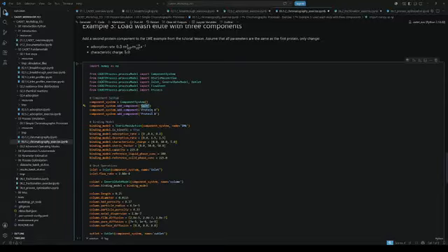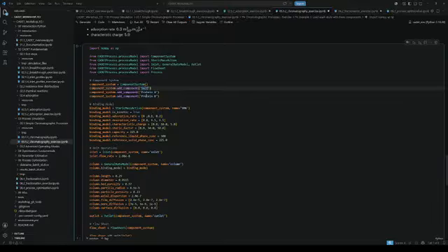We are now looking at 2 proteins, protein A and protein B, and a salt. And we have the salt because we're now not using Langmuir anymore, but steric mass action, one of the 3 adsorption models I've showed you before. And this steric mass action is often used for ion exchange processes where we have a salt component, in this case our salt. So 3 components.